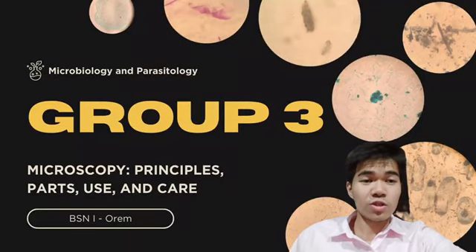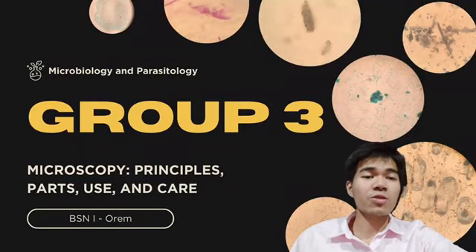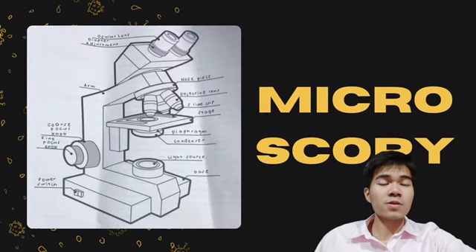Good day, I am John Tapira from group number 3, and today I will be discussing microscopy: principles, parts, use, and care. On the second slide, you can see this picture of a microscope that has corresponding names for each individual part.